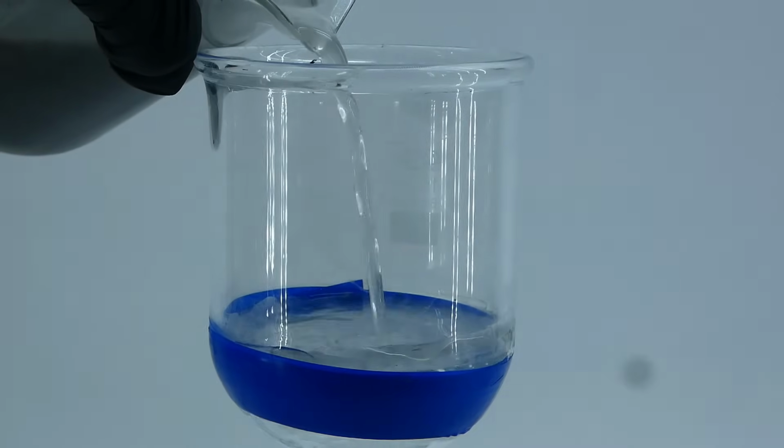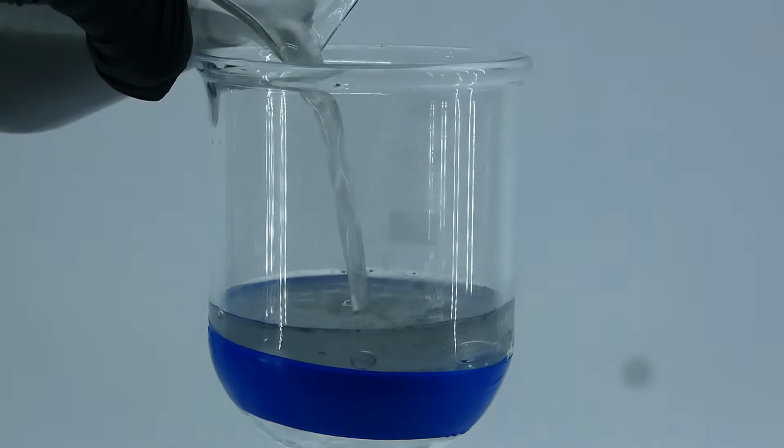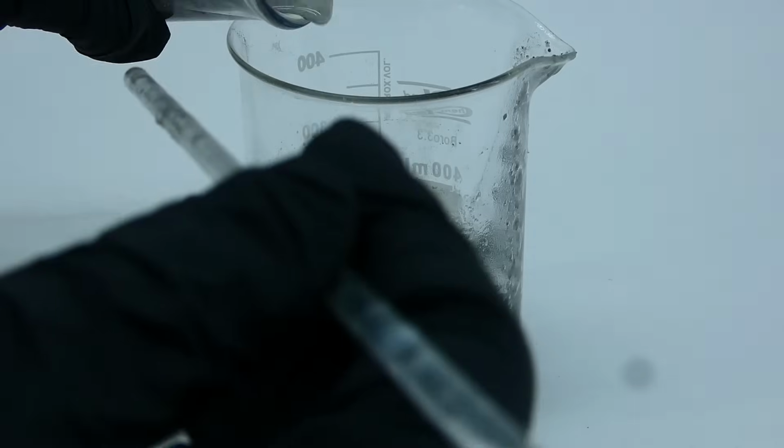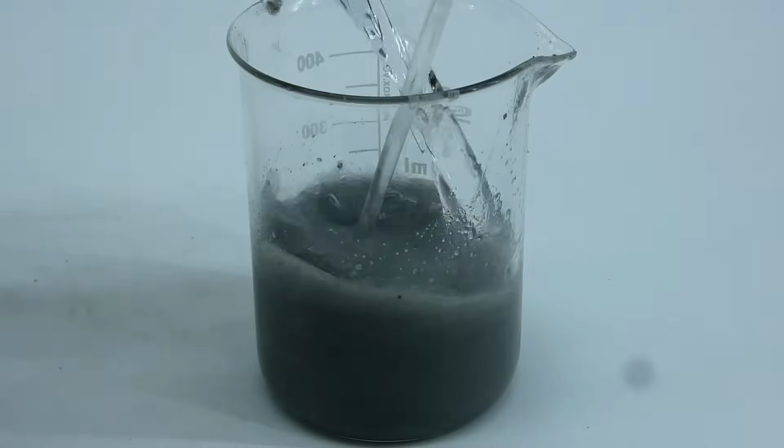I now had to remove the junk from the silicon, and to do that, I firstly vacuum filtered the whole mixture, and after that, I washed it with a lot of distilled water to remove all of the soluble stuff, and I was now left with some kind of a weird sand.